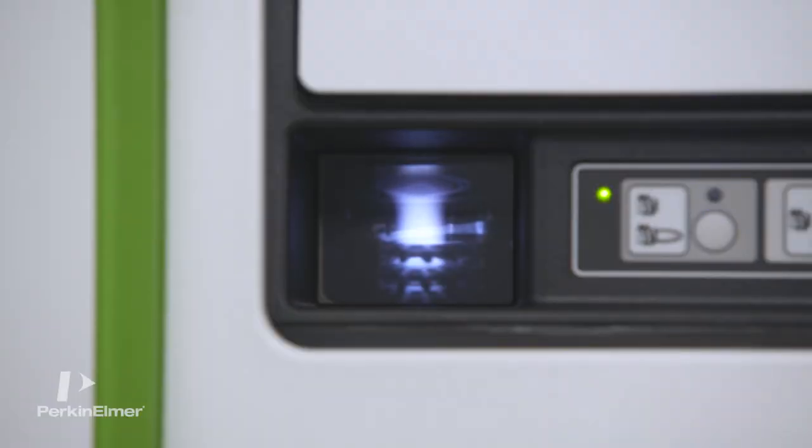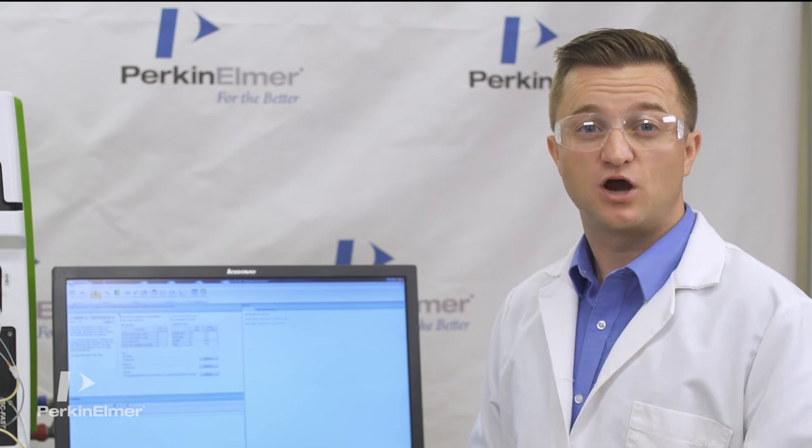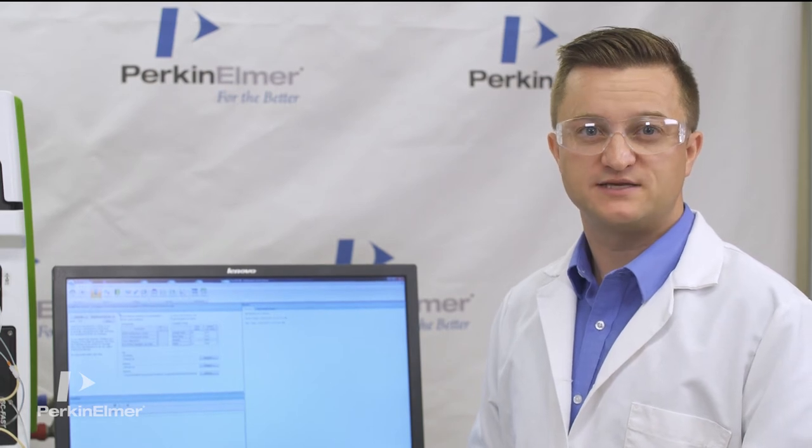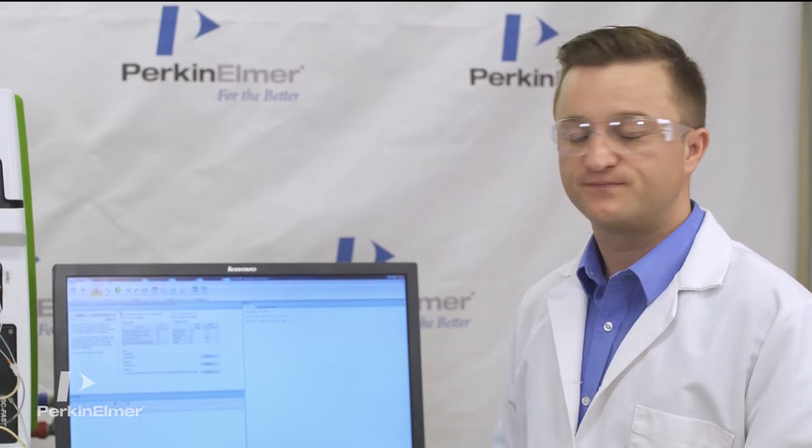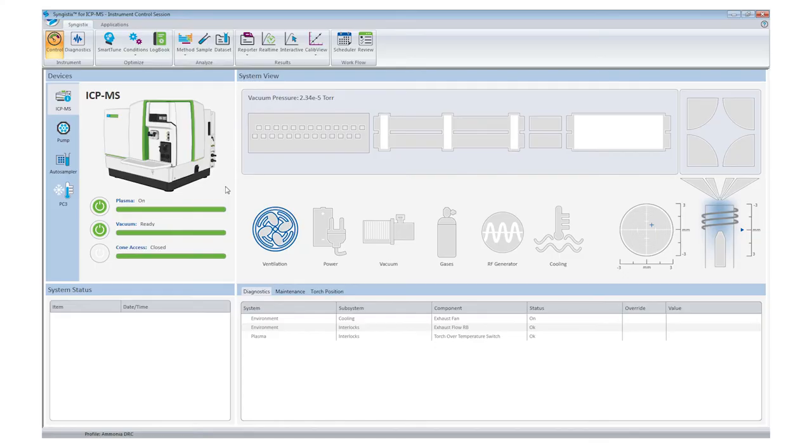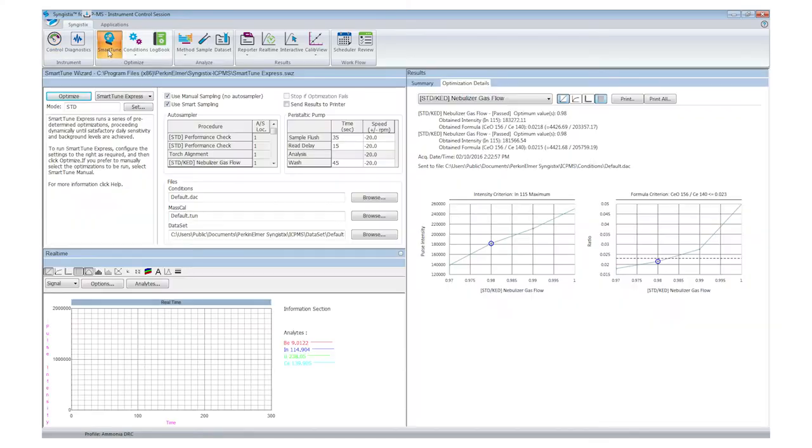Now that the plasma is on, let's start by optimizing the system using the Syngistics SmartTune wizard. Click on the SmartTune icon, followed by the Optimize button.